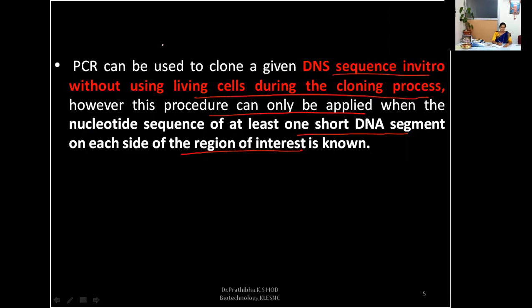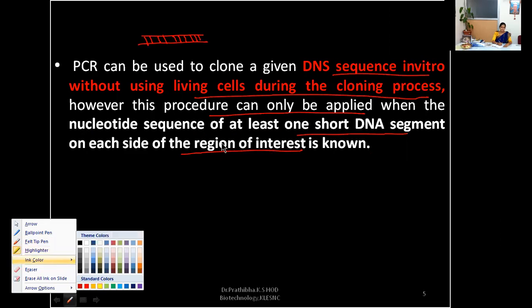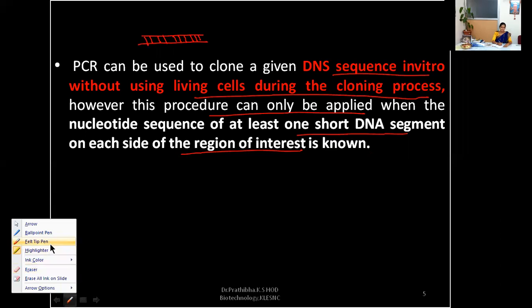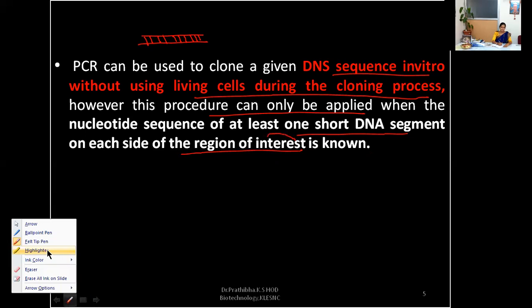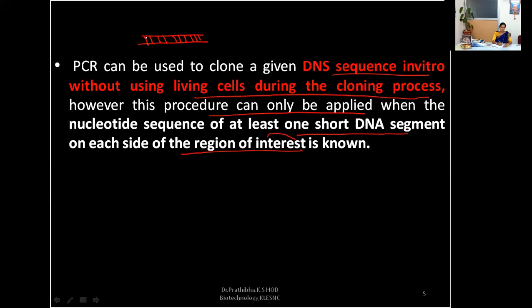It means that if this is the DNA strand, held together by hydrogen bonds, and you want to perform this PCR experiment, you must know the end sequences on each side of the region.